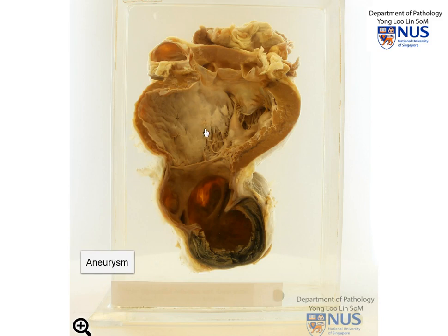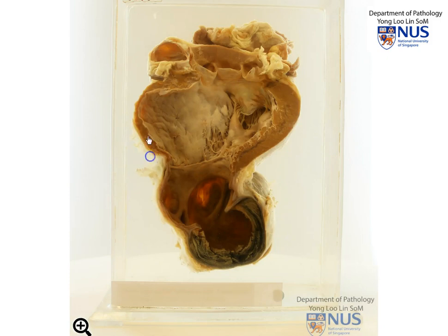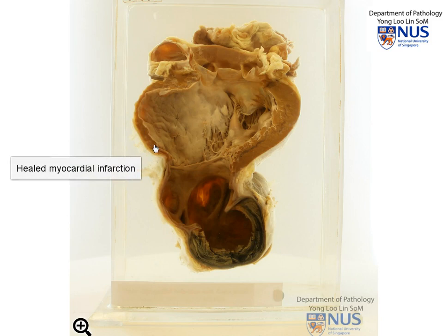Can we tell by looking at the specimen what caused the aneurysm? Actually, we can. If you notice, you'll see that the wall of the left ventricle here is much thinner than over this area. So this part is relatively normal, but over here the wall is very thin because there was a previous myocardial infarction or heart attack, the tissue died, and then there was healing.